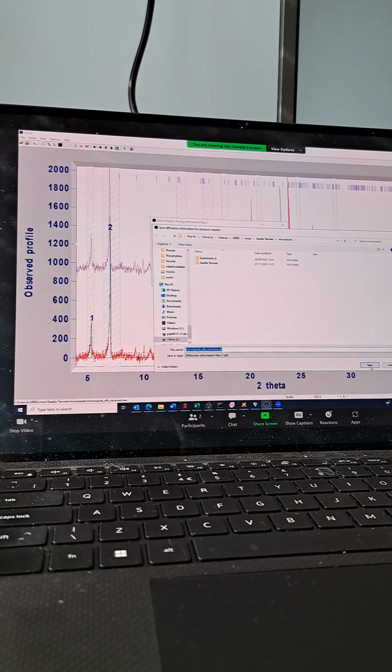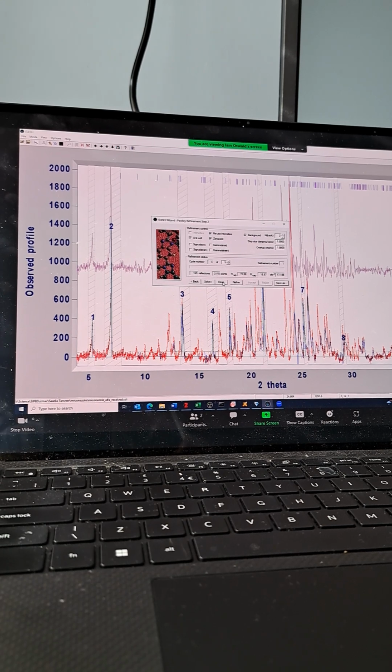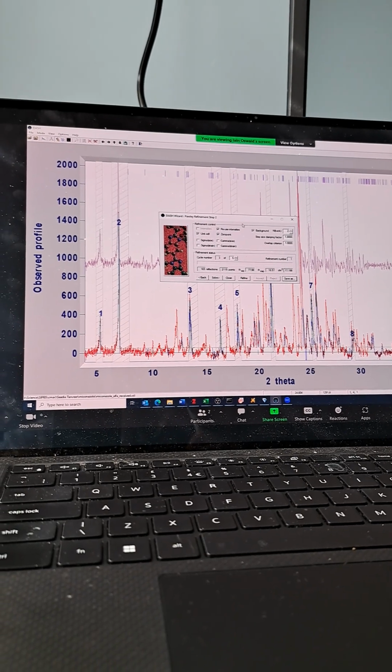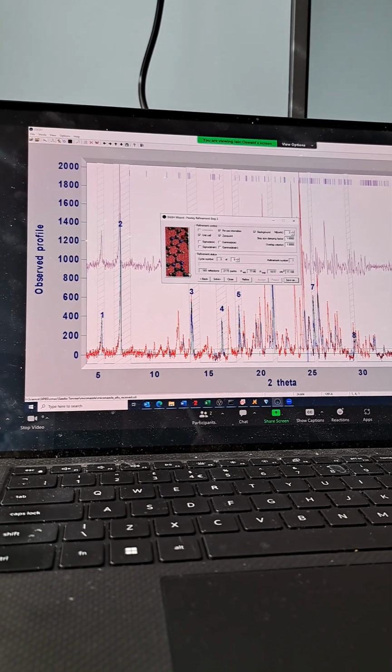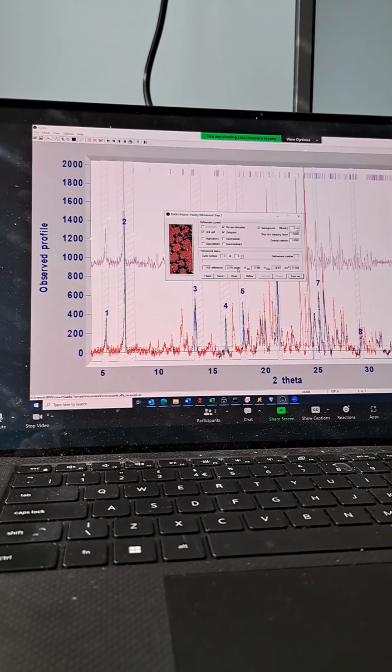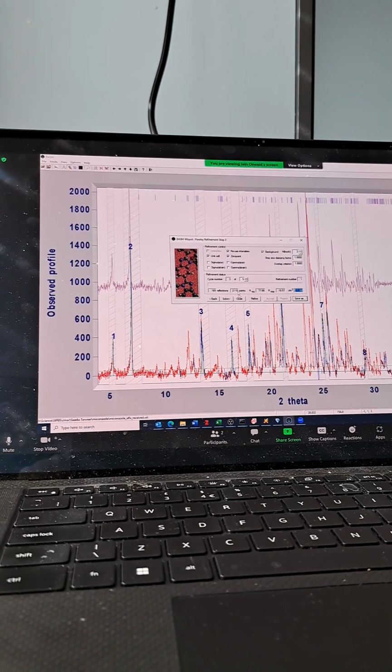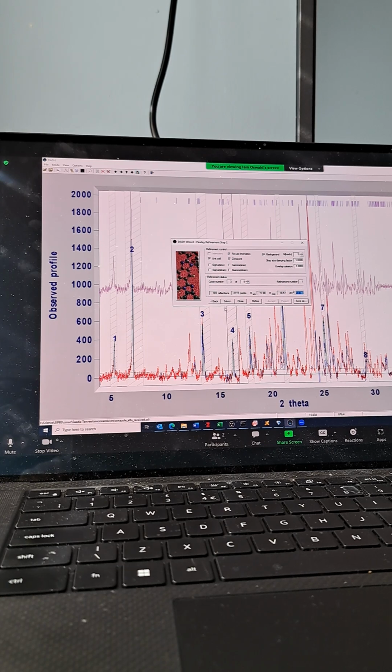Well, sure. If you've got known unit cell parameters, then you should be able to input those. For example, this gets you past the Pawley refinement. If you've used the unit cell parameters with your data, then you should get very low chi-squares. This isn't working particularly because it's the wrong stuff.